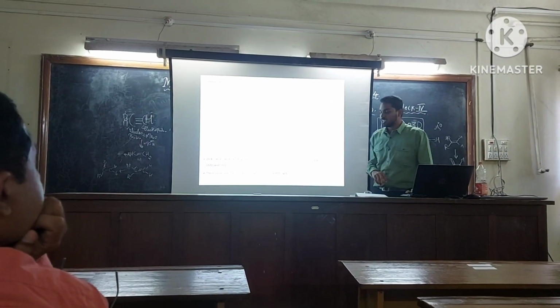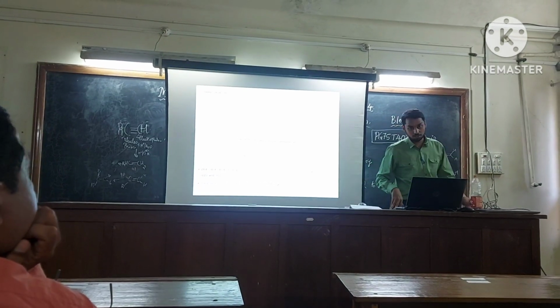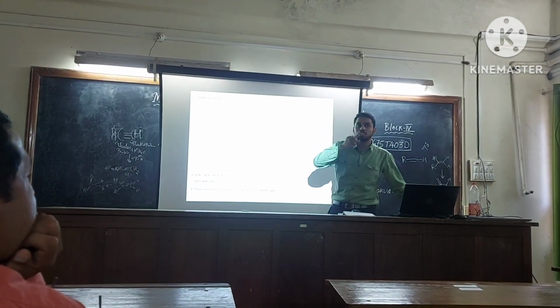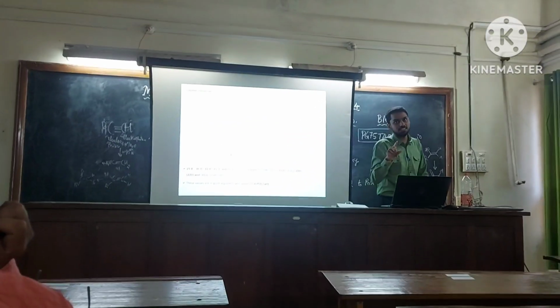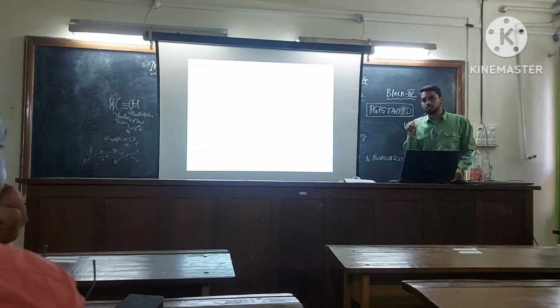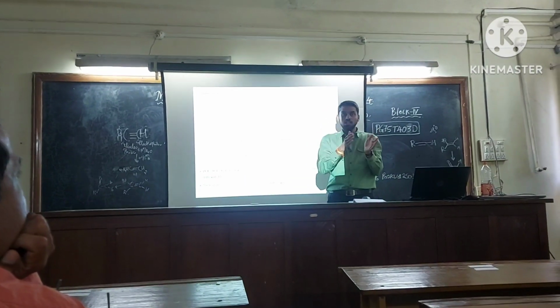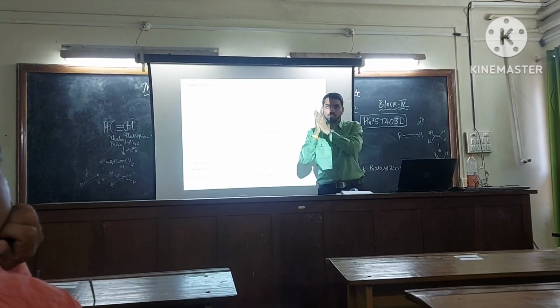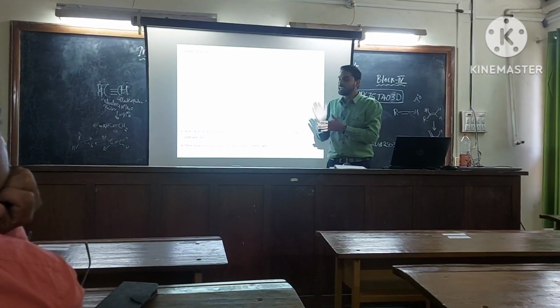So let us go for the characterization. Now we have synthesized copper oxide nanoneedles, but how will we come to know we have synthesized them? This is Cu2O, which means copper is in the +1 form. Initially we took copper sulfate, in which copper is in the +2 state. So basically we are reducing copper +2 to +1, and we are using Peltophorum pterocarpum as a reducing agent.